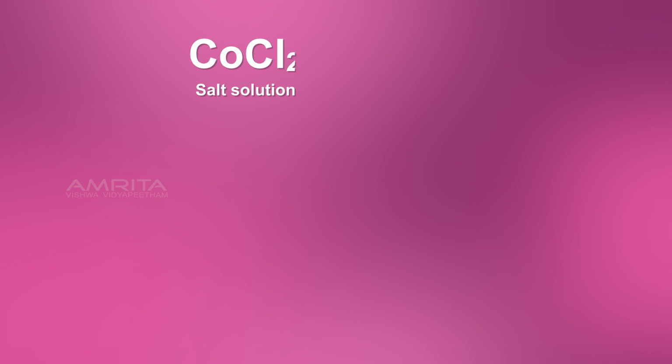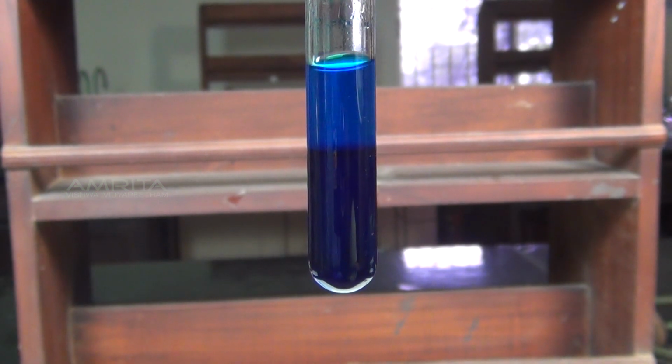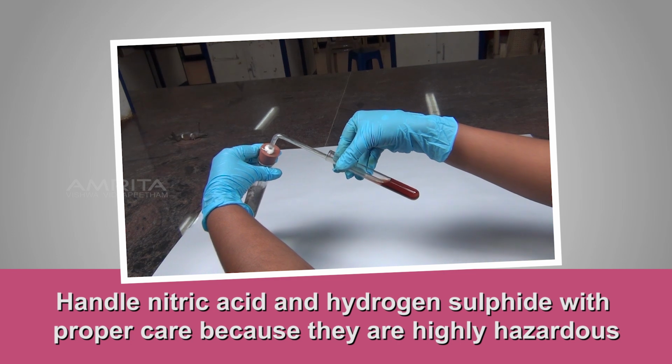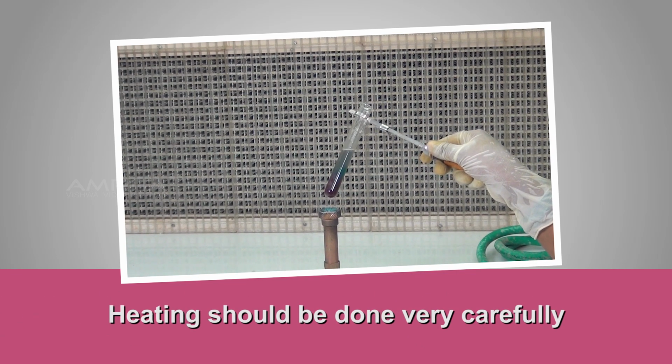Cobalt ions present in the salt solution react with ammonium thiocyanate to form ammonium tetrathiocyanatocobaltate 2, which gives blue color to the ethereal layer. Precautions: Handle nitric acid and hydrogen sulphide with proper care because they are highly hazardous. Heating should be done very carefully.